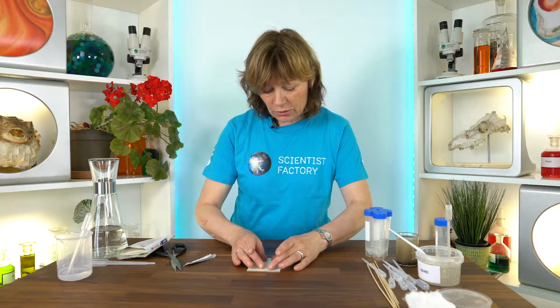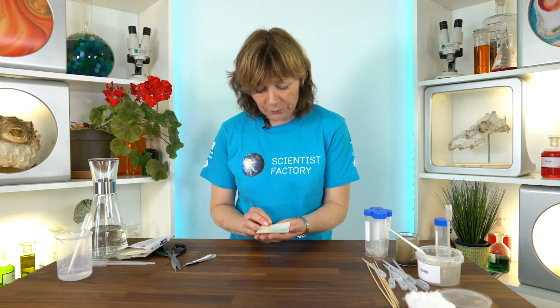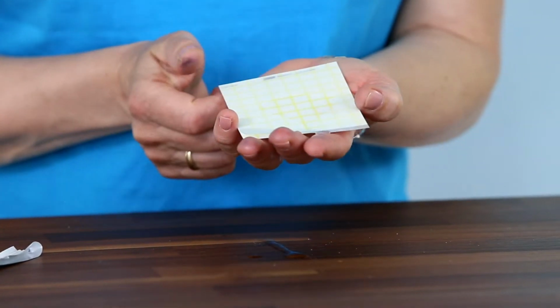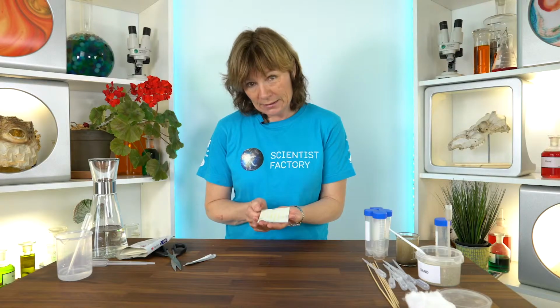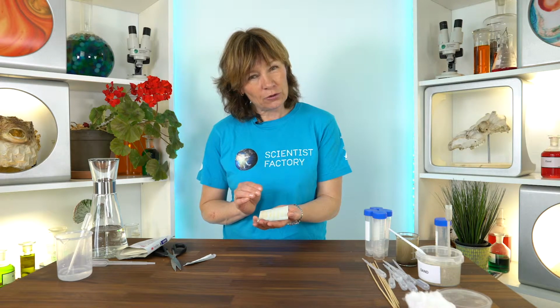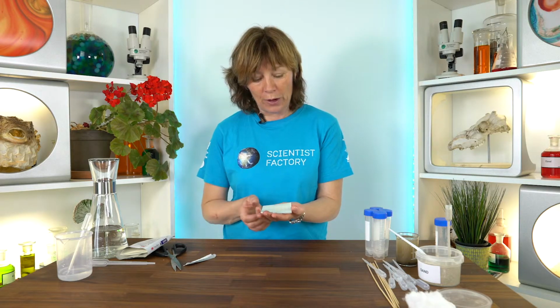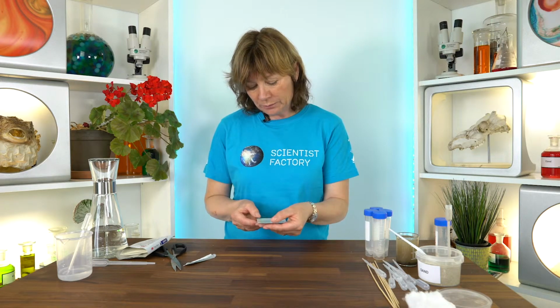And it's just going to be like this. You have to hold it flat, but I'm just holding it here to show you. But it's going to be like this, and you just lay it somewhere warm in room temperature until the next day. And actually next morning you might not see anything, but very often in the afternoon you can see dots coming up. Maybe you have to wait 2 or 3 days. It all depends on the temperature where you are. So that's how you use the Petri film.